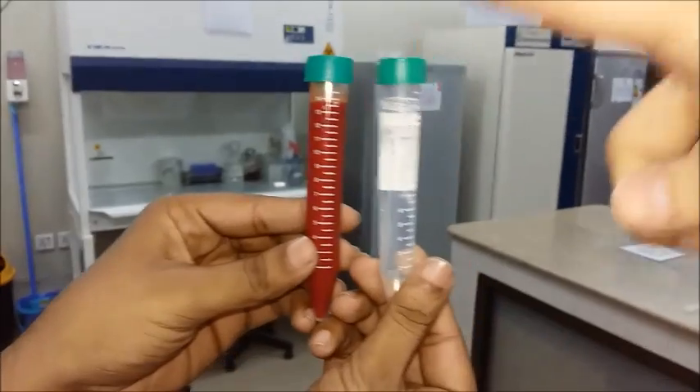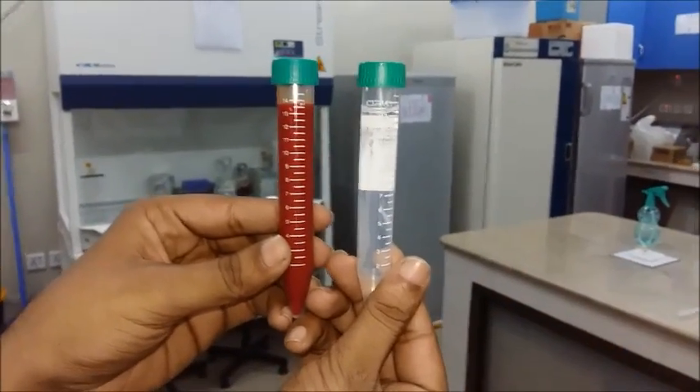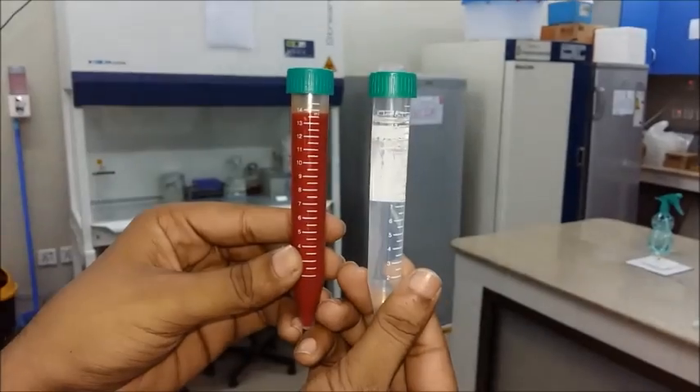This is our blood, and this is the balance we are going to use because we are supposed to centrifuge it. Both tubes need to be equal in weight.